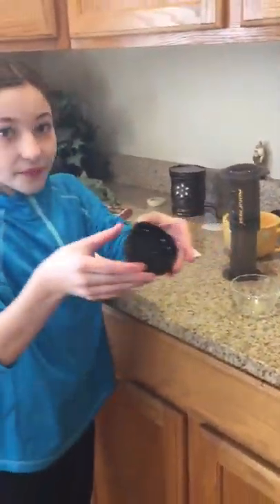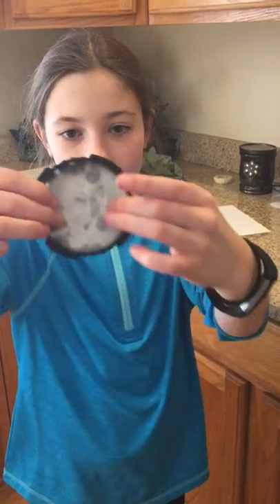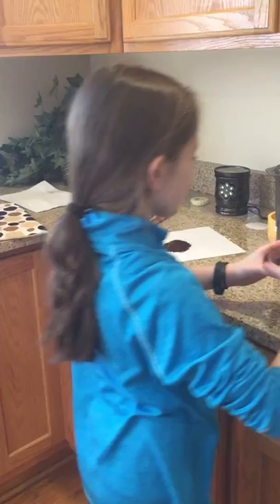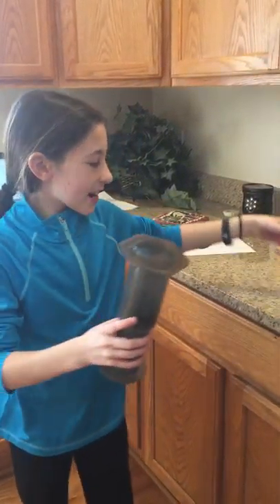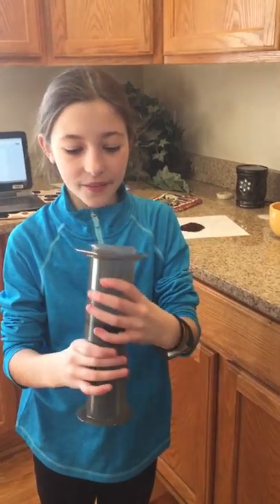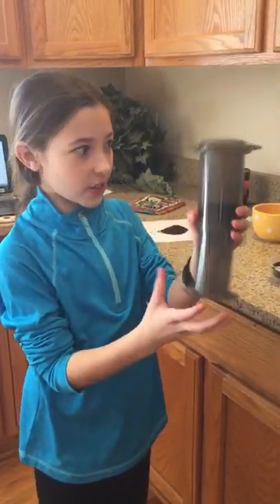So now you have a funnel and a filter. You're going to get one of these filter papers and put it in there — mine's already wet, but it's okay if it's wet. You want to have a bowl so it can hold the water that you're going to pour. And you want to make sure, because you have to put this on top of here, that it fits the right way. Because if you don't, then you're going to have to start all over. It pushes through, and we're going to be using that to get our coffee.